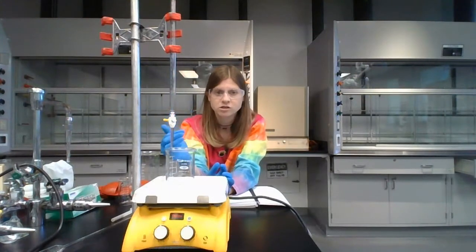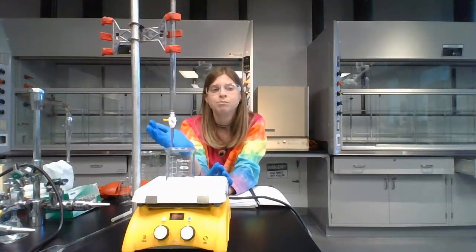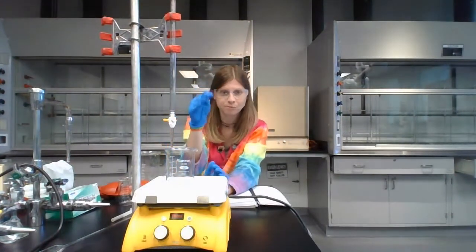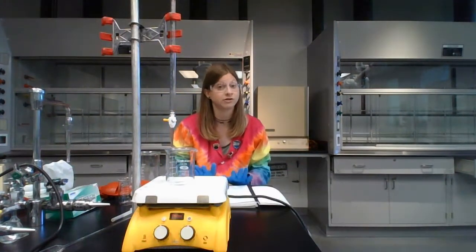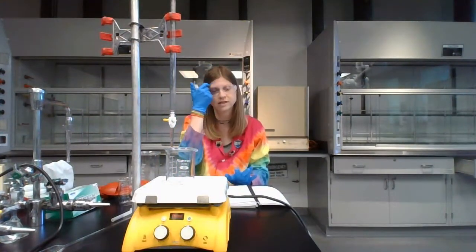When you add it, the solution down here is going to turn purple, like immediately, to where you think, oh my gosh, the reaction's over. No, it just takes it a minute to catch up. So what's going to happen is it's going to turn dark purple. But keep adding the potassium permanganate, and then all of a sudden that dark purple color is going to disappear, and it's going to go back to being a clear, colorless liquid. That's supposed to happen. That'll happen at the beginning of every titration with this lab.